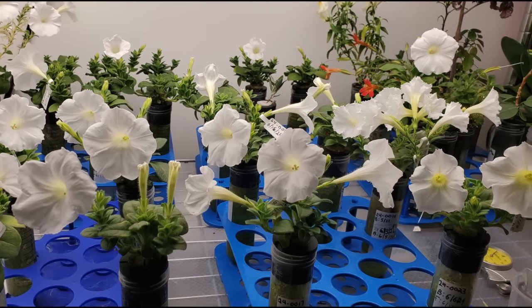So salmon lay eggs, and then the male salmon kind of crop dusts over it with its sperm. And so nature evolved a really sticky genetic material that allows for the binding. It's like DNA glue, right? And so you glue the DNA onto the tungsten particles with salmon sperm extract.